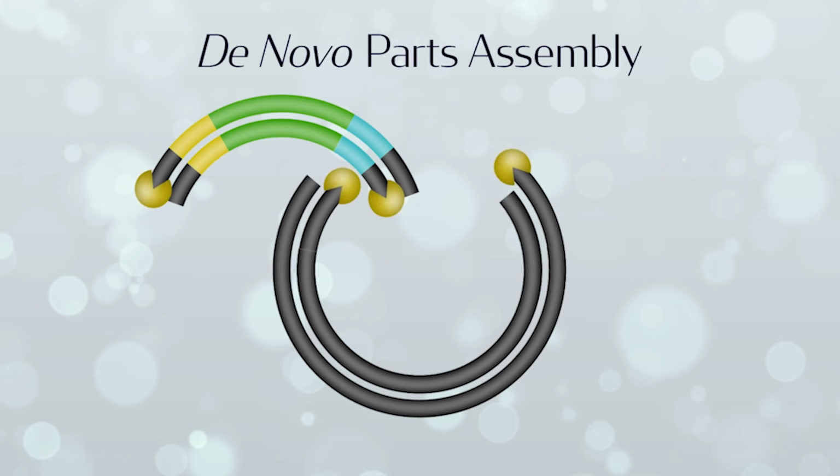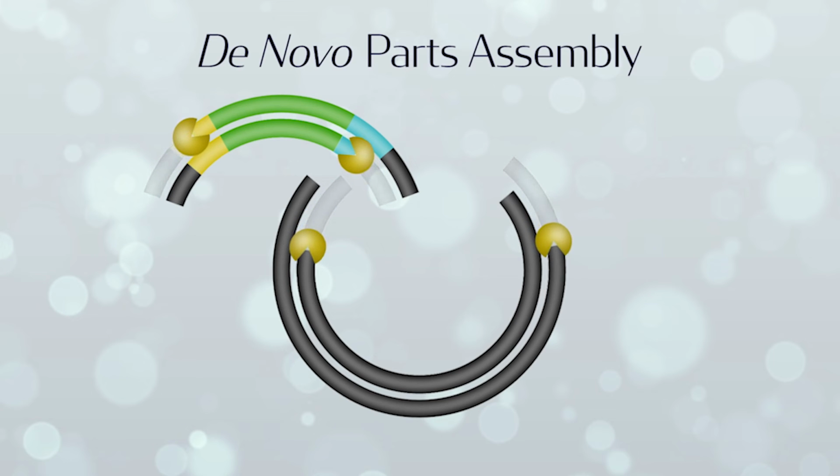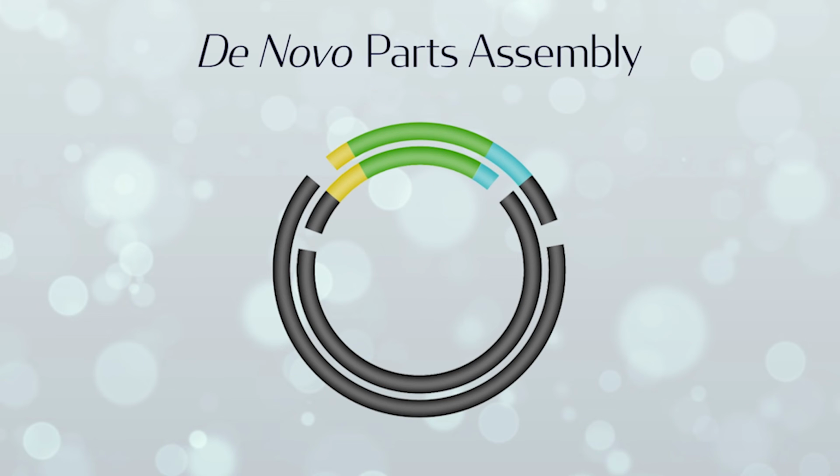Due to the continuous activity of the 5' exonuclease in the single isothermal step, the 5' end of the now double-stranded oligo is degraded as well, so the oligos can anneal. Afterwards, the DNA polymerase fills up the nucleotide gaps and the DNA ligase seals the nicks. The result is the desired sequence in the backbone.